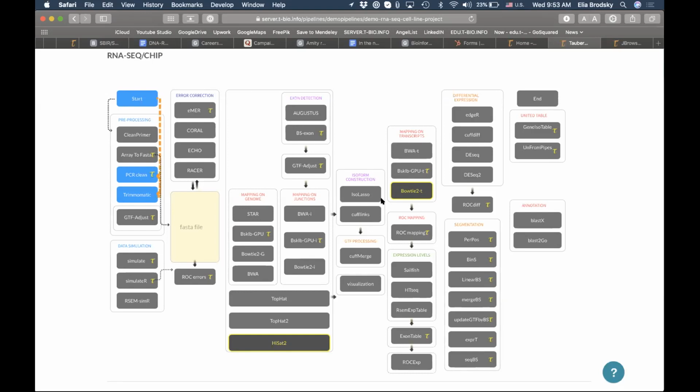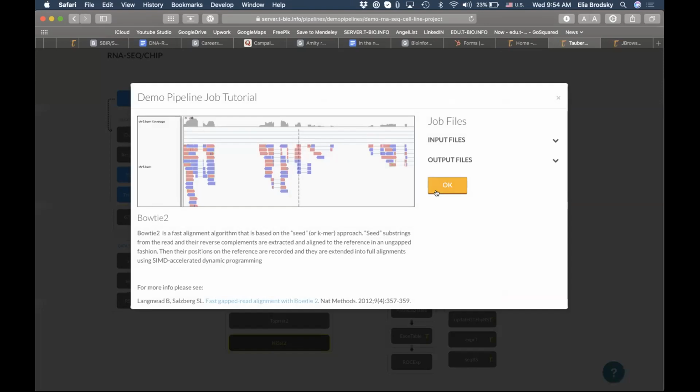And so if we want something very detailed to understand the alternative splicing events that we have per sample and really understand the isoforms that are expressed in each sample, we would want to use this combined strategy. If we want to just understand known isoforms or known genes, how are they expressed, we will use this annotation file. And computationally, this is a more effective way of doing it, but you lose some resolution. So let's first try this one.